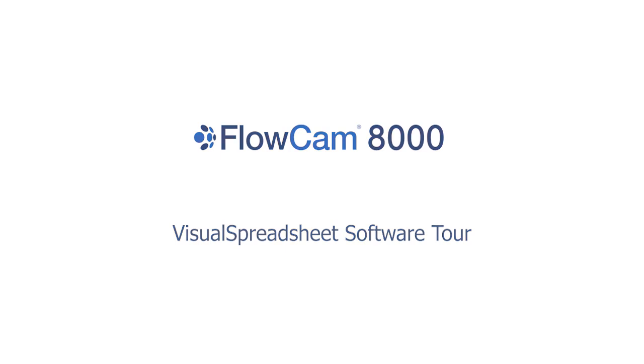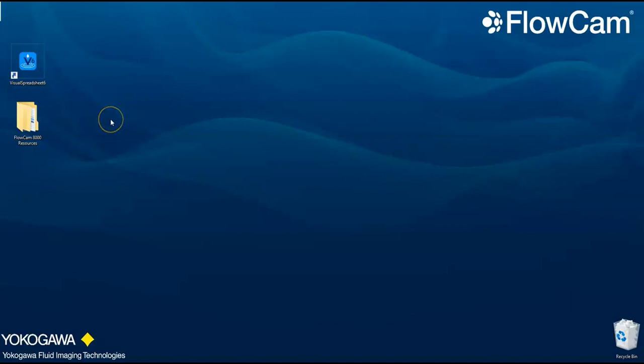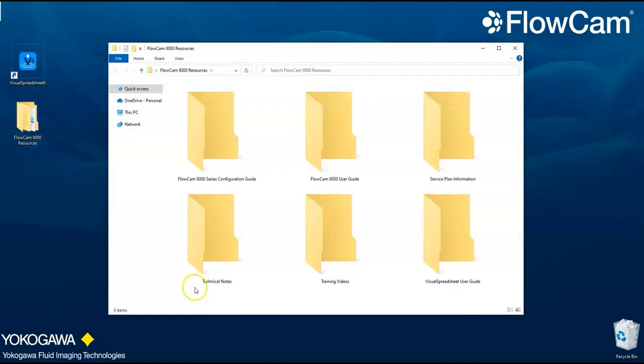your Desktop Resources folder. On the FlowCam desktop, you will find icons for VisualSpreadsheet and your FlowCam 8000 Resources folder. The Resources folder content will vary depending on your FlowCam instrument and application, but generally will include the FlowCam 8000 Configuration Guide, the FlowCam 8000 User Guide, details about the current FlowCam Gold and Silver service plans, technical notes, FlowCam 8000 videos, and the VisualSpreadsheet User Guide.